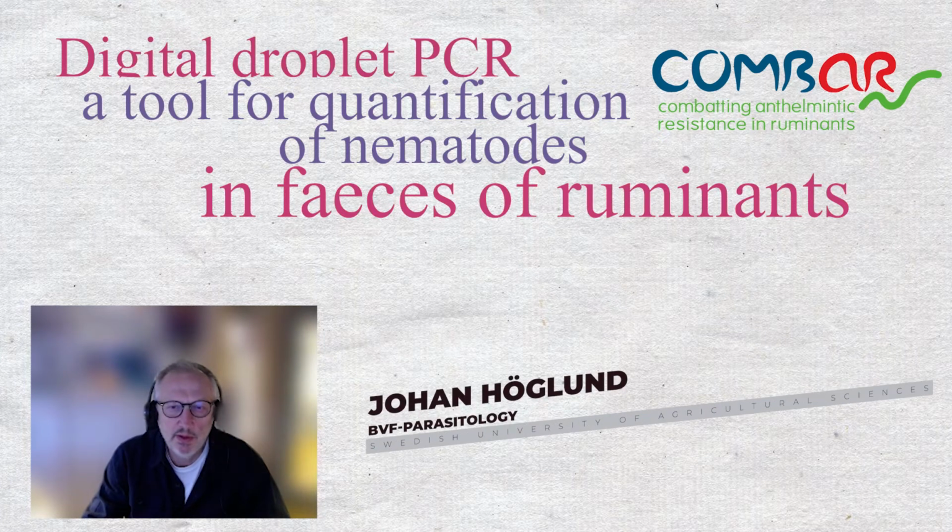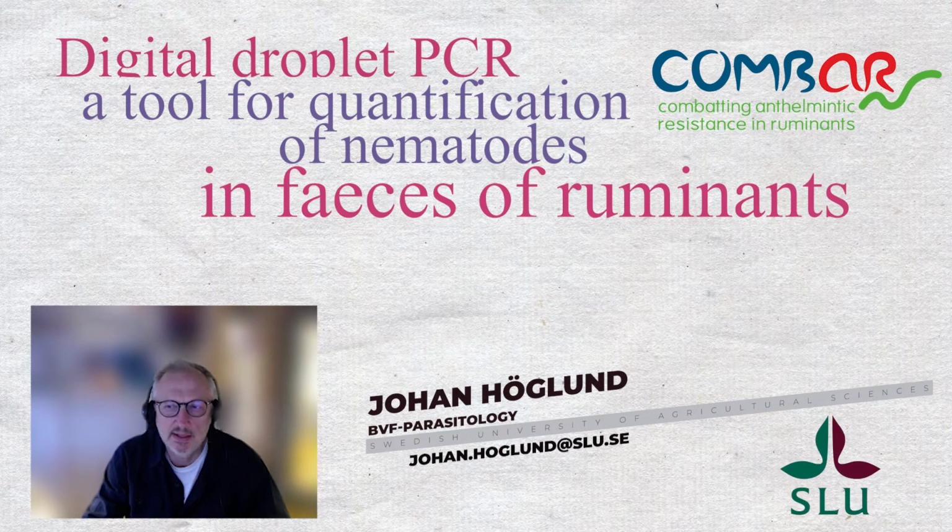My name is Johan Höglund, and I'm leading a group at the Swedish University of Agricultural Sciences. We are working on helminths of veterinary interest and how they respond to anthelmintic treatment. For some years, much of our research has relied on various molecular applications, and in particular those based on ddPCR.